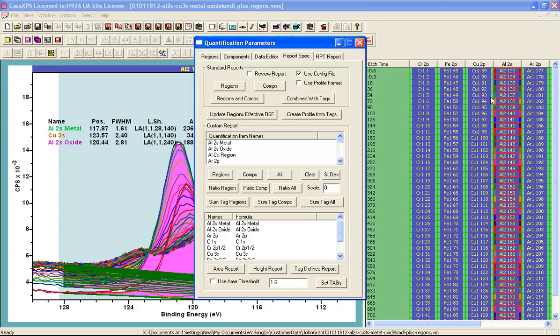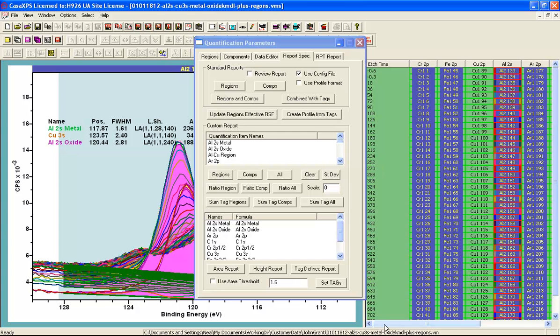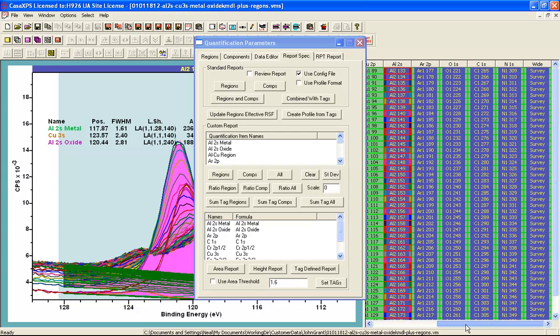So what I need to do is deselect VAMAS blocks that are not required for this particular calculation of a depth profile.